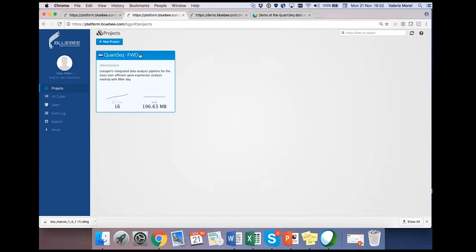Julian is asking, 3' sequencing being different from classical whole mRNA sequencing, do you use a special gene annotation for 3' sequencing? As I said, for the Ensembl annotation, it works fine. We had customers, I think it's also on our webpage, in our first webinar, where they sequenced chicken, and there they needed to extend the existing annotation.